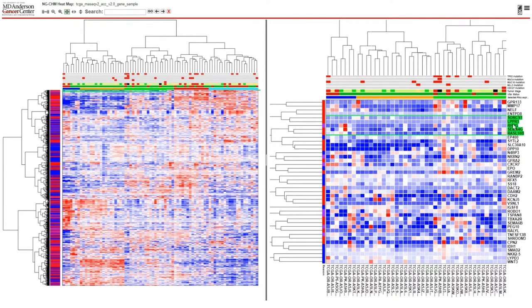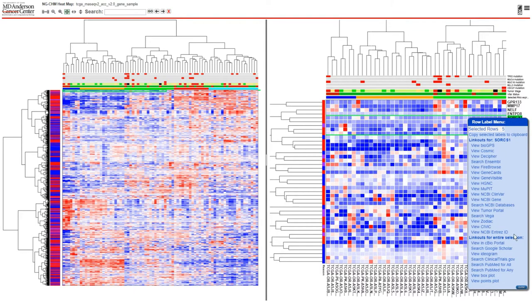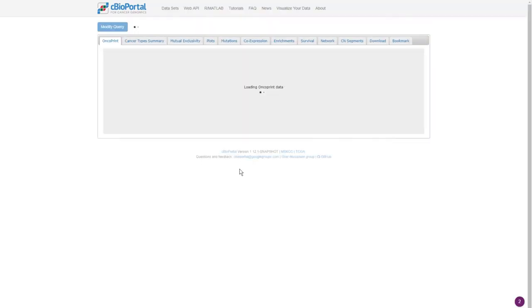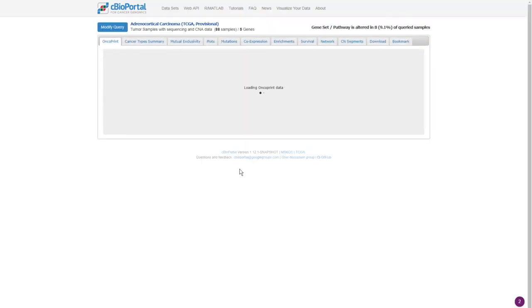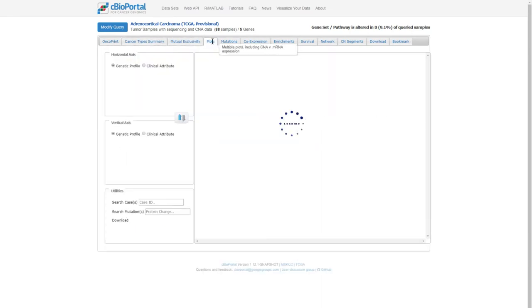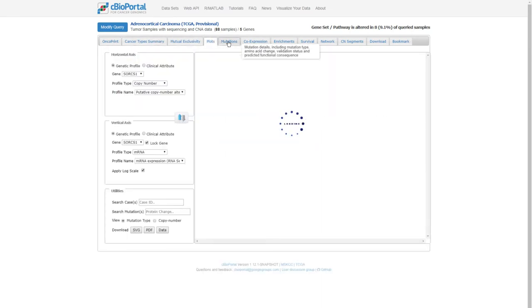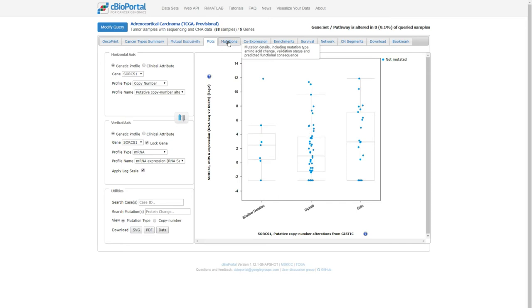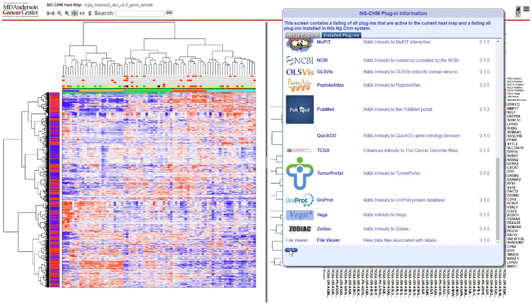Some link outs require additional information. For instance, link outs to cBioPortal require the identifier to a specific cBioPortal study. Such link outs will only be displayed if the additional required information is included as a map property. Server-based viewers may also include computational link outs, such as those based on the statistical toolbox. These are covered in a subsequent video.